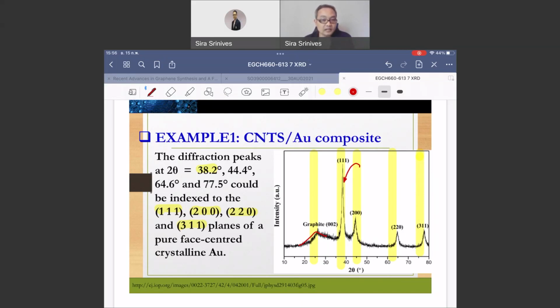I don't know about that. You need to look into the database, and see if it shifts from the position that it's supposed to be. Let's say it's supposed to be around 40, but it actually appears at 38.